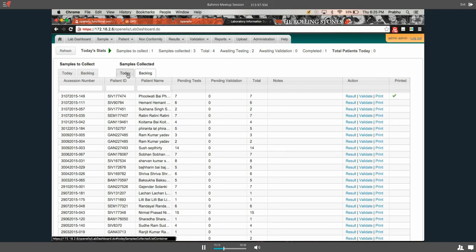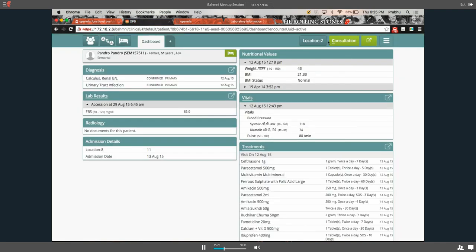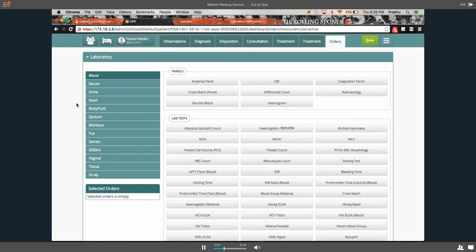We had just added a new sample for a patient, and we can see that it has 14 pending tests. Now, I'd like to quickly show you the difference of when we order a test from Bahmni. If I go to the consultation of this patient and look at orders, I can see that a similar setup has been done in Bahmni.